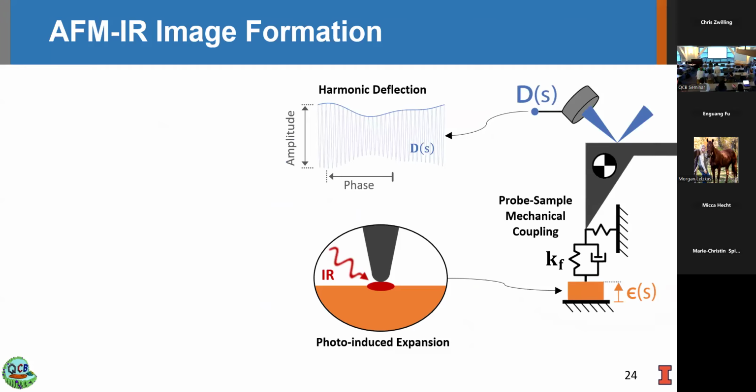The amplitude of this periodic deflection shown above is proportional to the local IR absorption of the sample beneath the tip. The signal is then filtered using a lock-in amplifier to recover the first harmonic of this periodic function and isolate it from the DC deflection in order to isolate the signals used for actually height tracking and recording IR data independently within the same signal.